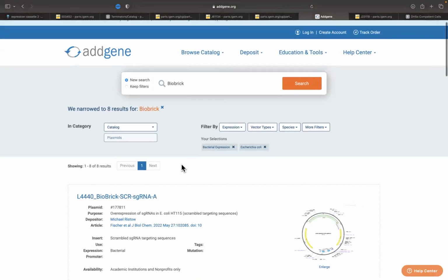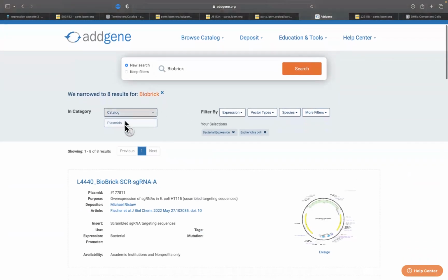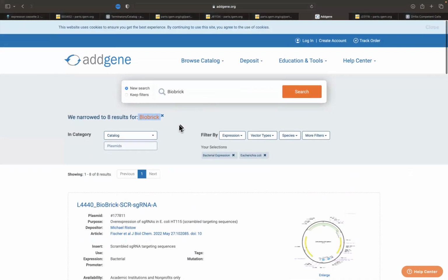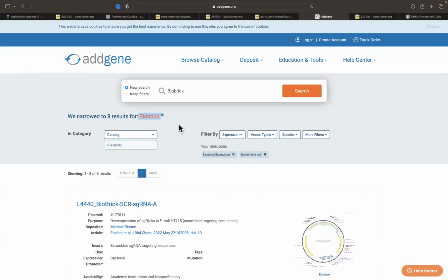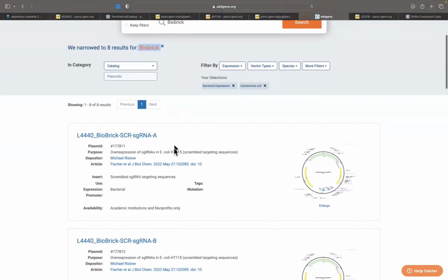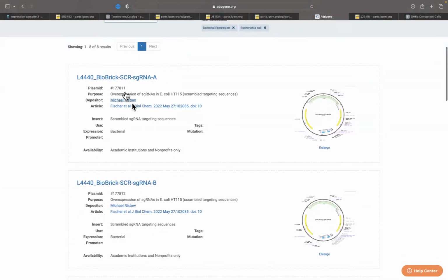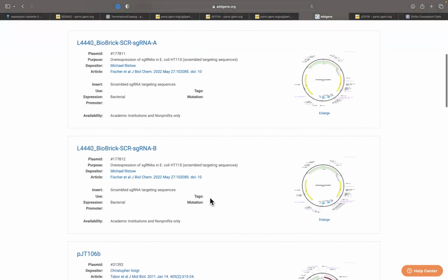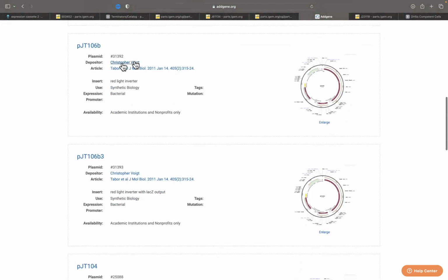Okay, so if you look at what I've been doing, I've been looking for BioBrick standards. So I just search for BioBrick. These usually contain the BioBrick CSR, a multi-site with all the enzymes involved in the BioBrick and some others that you can open and use as you want. Each plasmid has... these are all single guide RNA, so these ones are for CRISPR-Cas9. We're not interested.